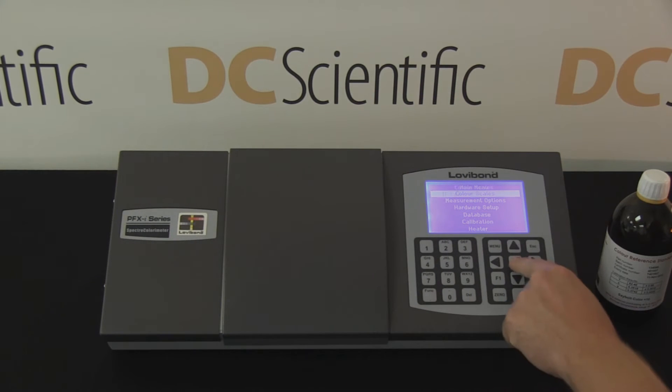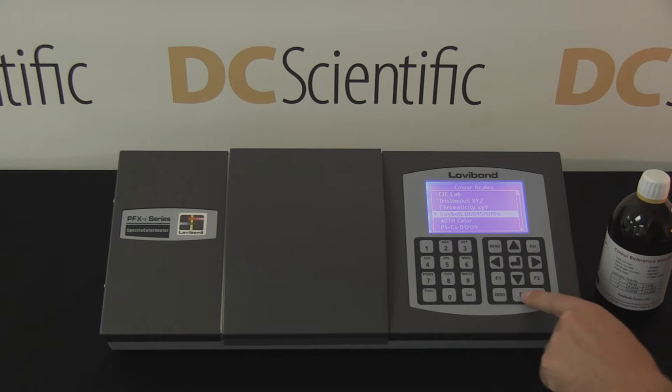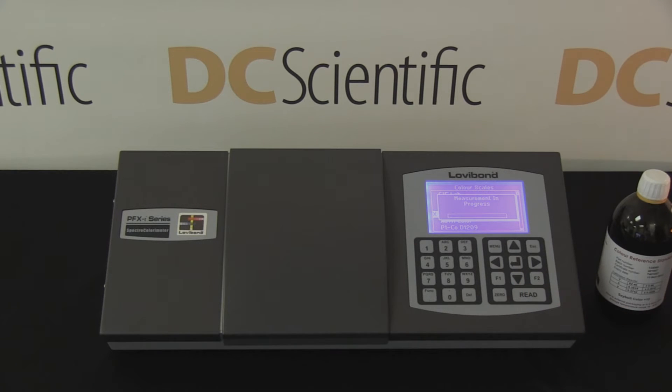The technician then selects the appropriate color scale, ASTM D156 Seibold color, and presses the read key. The measurement takes approximately 25 seconds. Progress of the test can be monitored on the on-screen status bar.